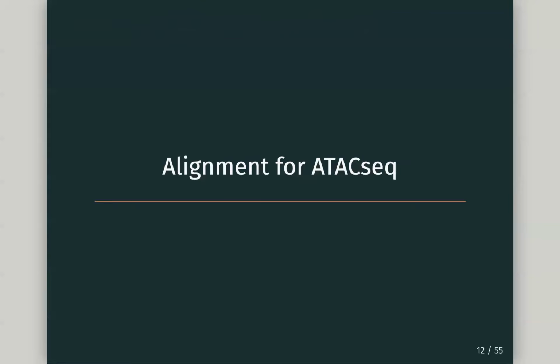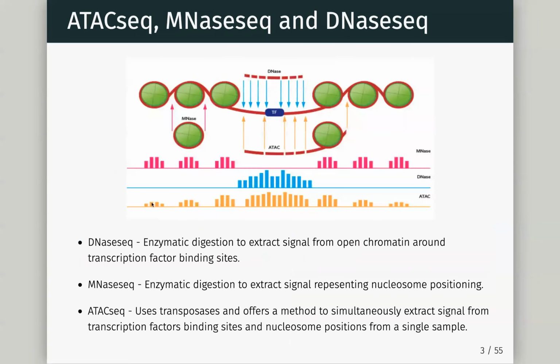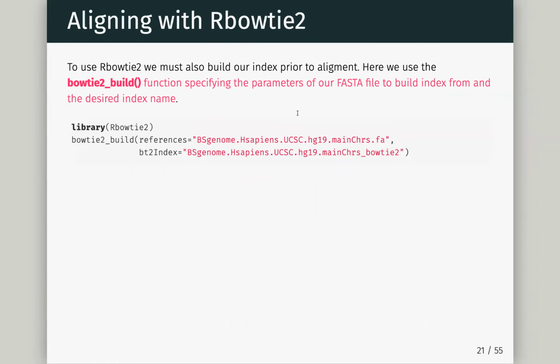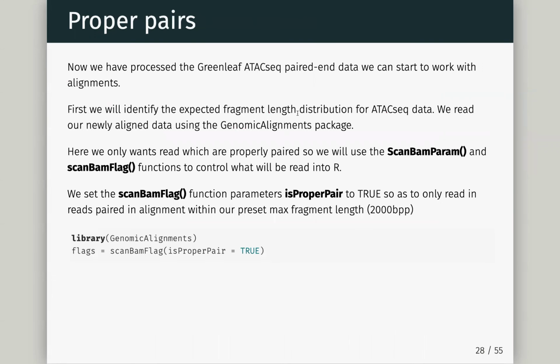So just to remind us, that's because we should have regions coming from around nucleosomes. We should also have regions coming from inside, well, this is the nucleosome-sized one here, from inside open regions. So these are also a very important QC for us, and they were important QC for that original paper.